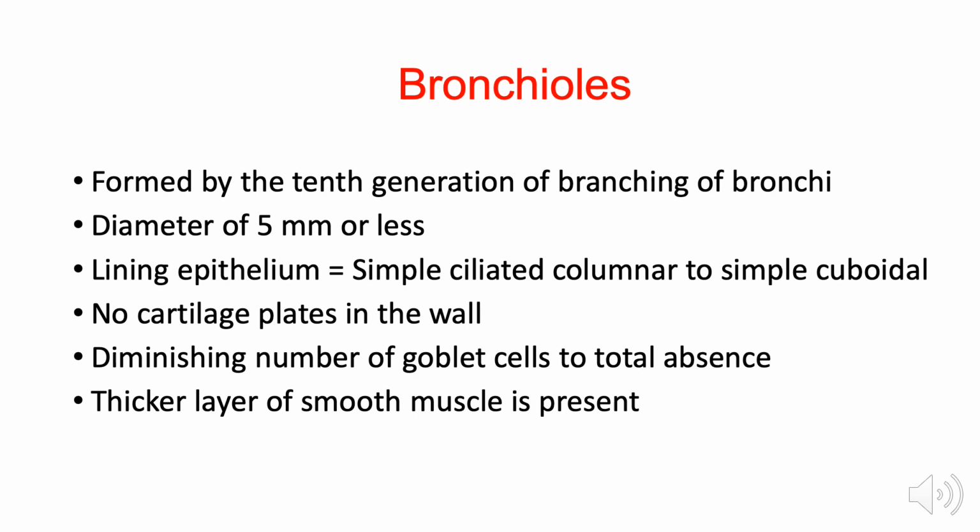There are no cartilage plates in the wall. There is a diminishing number of goblet cells, a decreasing height of epithelial cells, and you have a thicker layer of smooth muscle, which will function to provide support.